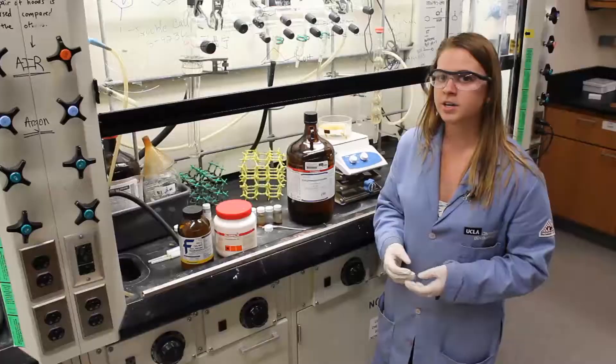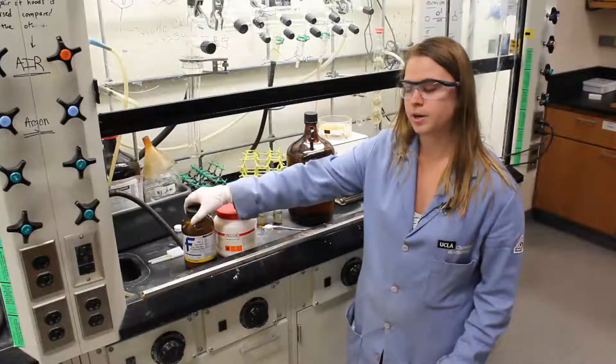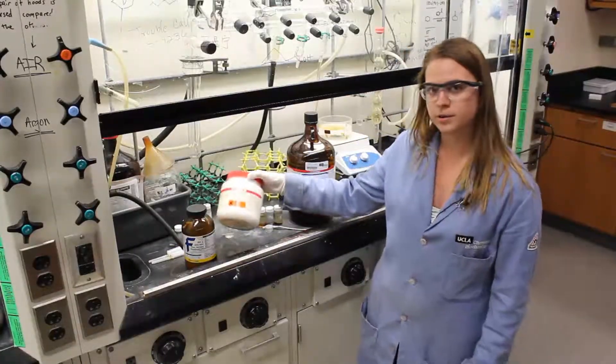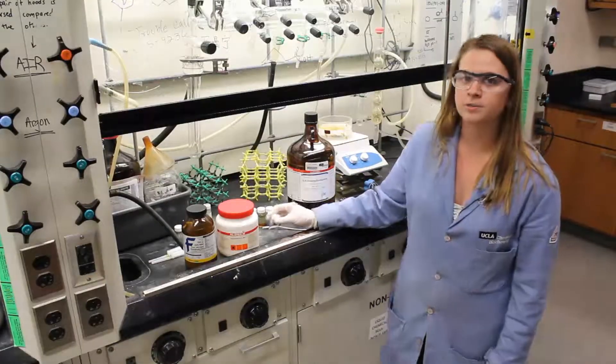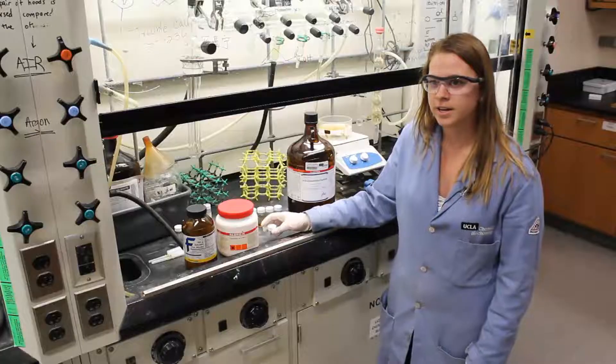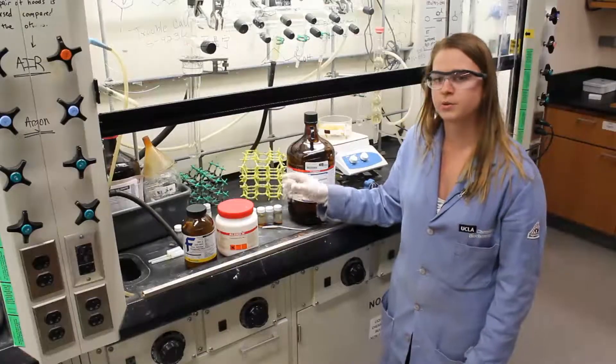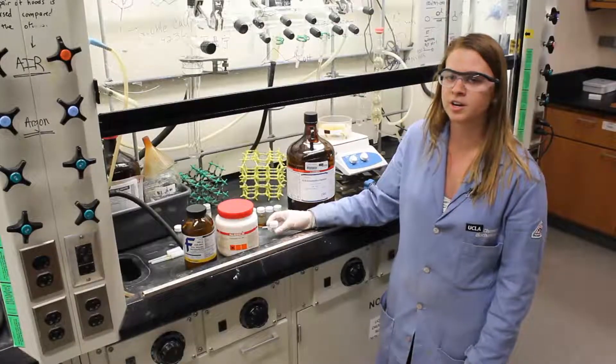In order to make it, you would mix zinc, which is the inorganic component, with terephthalic acid, the organic component, in a vial with either DMF or DEF as a solvent. And after we've swirled it and make sure we have a homogeneous solution, we're ready to put it in the oven.